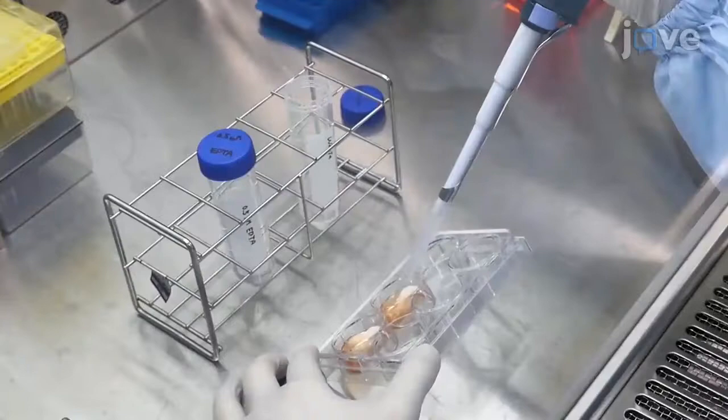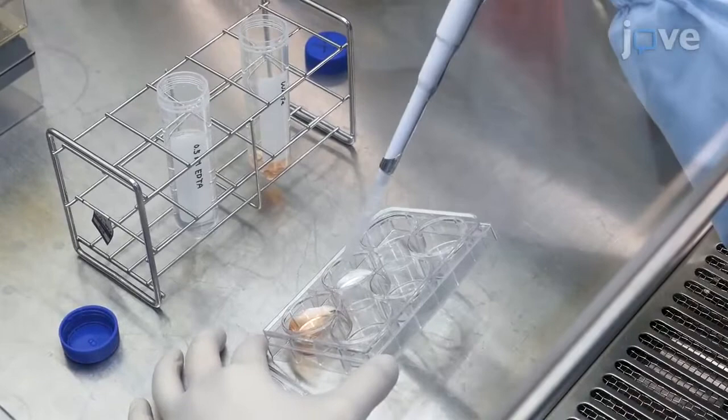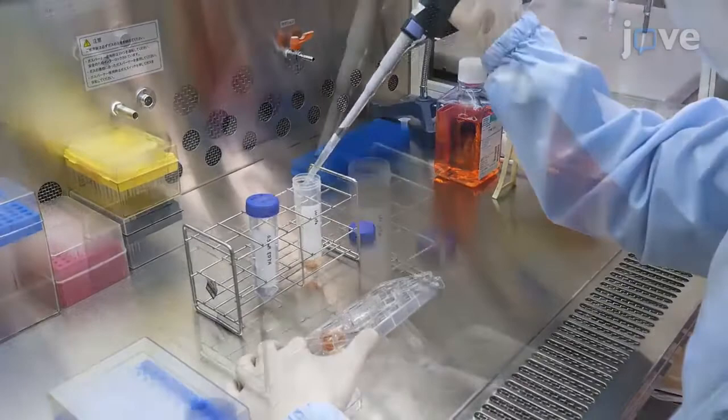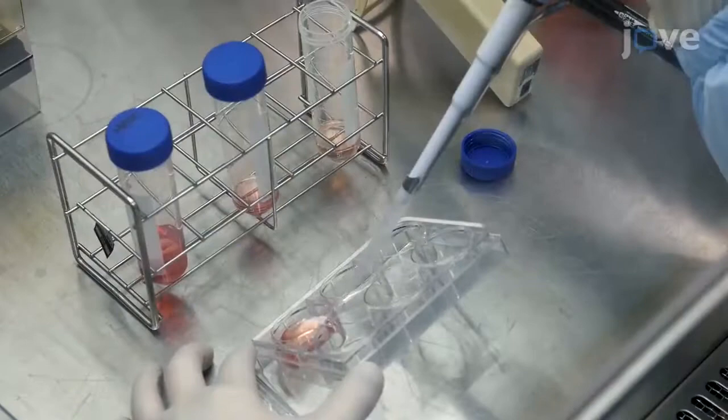First, aspirate the used medium, and use a pipette to add 2 mL of 0.5 mM EDTA to each well to wash the HPSCs cultured in the 6-well plate. Then, aspirate the EDTA from the wells and add 2 mL of fresh 0.5 mM EDTA to each well. Incubate the plate at 37 degrees Celsius for 5 minutes.